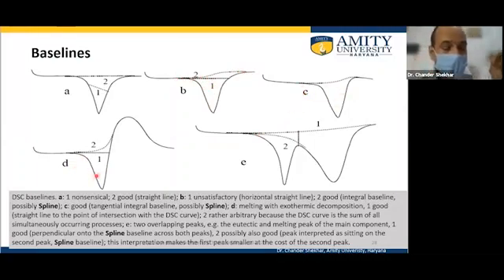In the case of an event where melting and decomposition are associated, a horizontal line is what is recommended, not a curved line. A curved line will accommodate the decomposition at this particular point as the baseline, so it will suppress the information corresponding to the decomposition of the material. And if there are two transformations happening at very close temperatures, for example, in the case of a eutectic alloy, the baseline generally recommended is the horizontal line in this case.